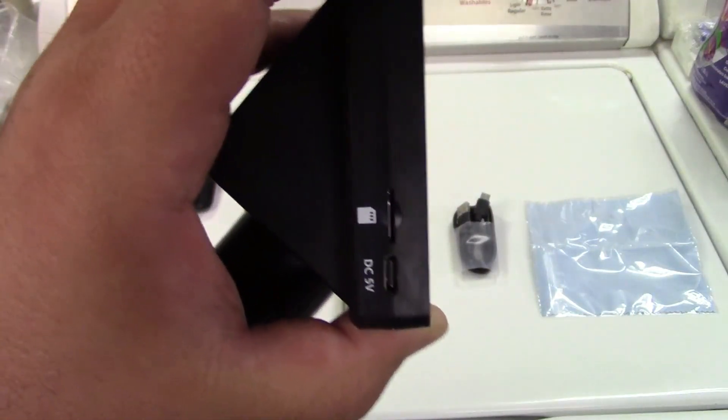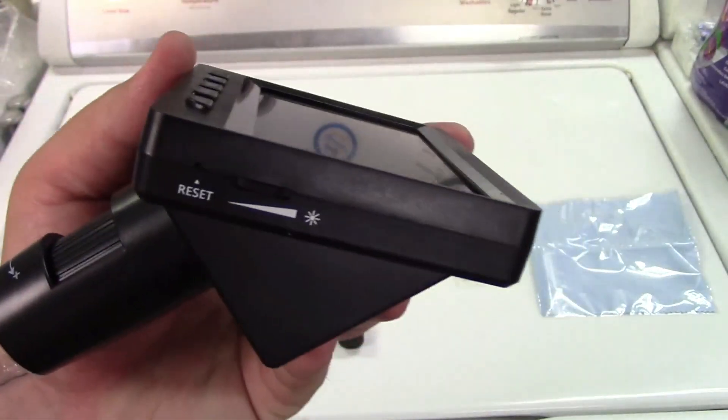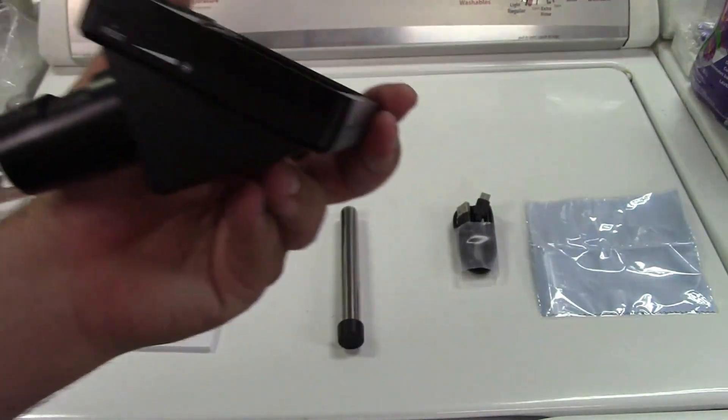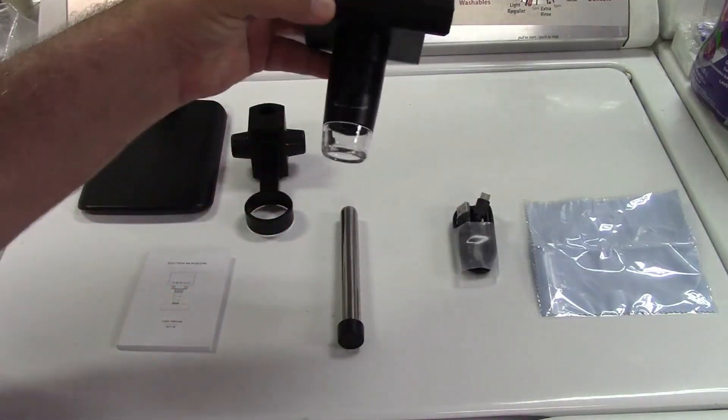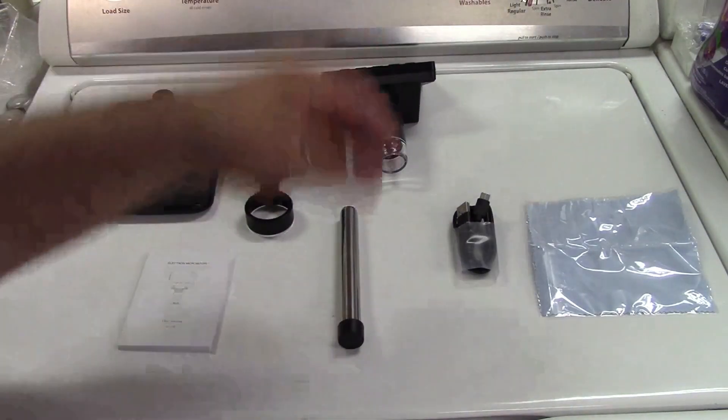USB charge port and a microSD card slot, and over there you can control the brightness of the lights and a focus ring down there. I'll show you that in more detail in a bit.